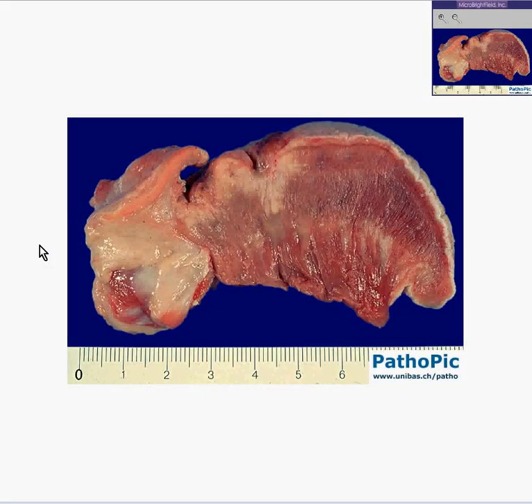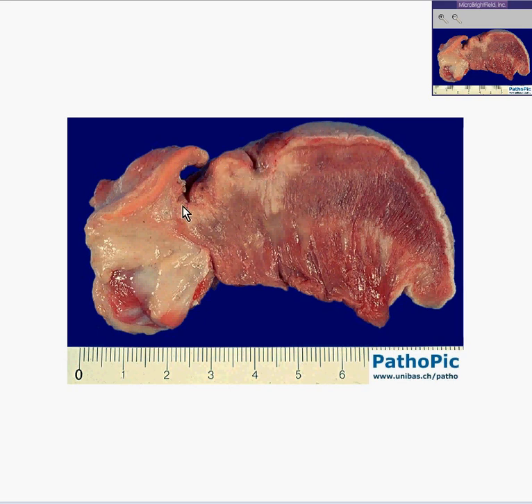Here we can see a very nice median sagittal slice of the tongue. Here's the anterior portion, here's the posterior portion, and here's the epiglottis.